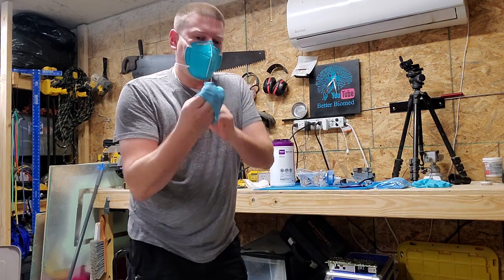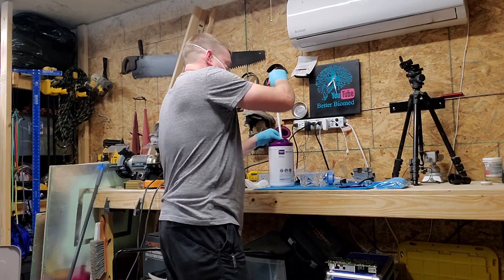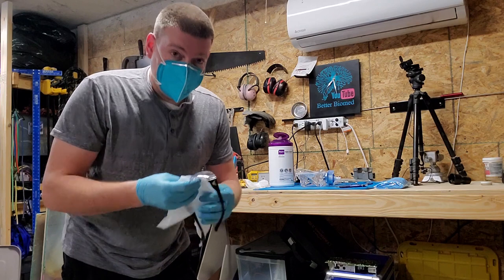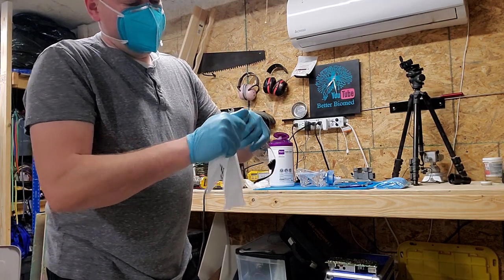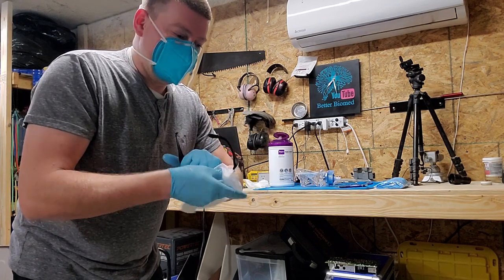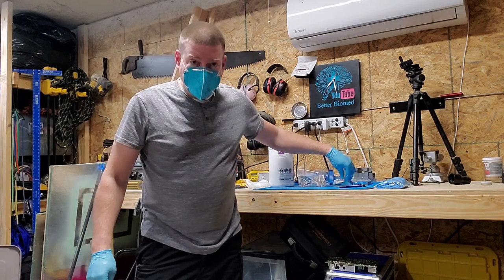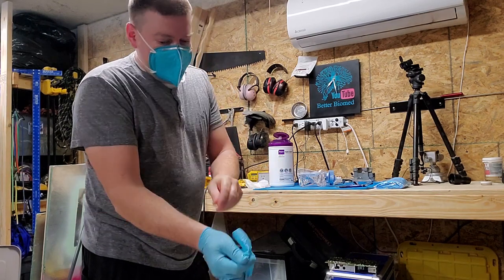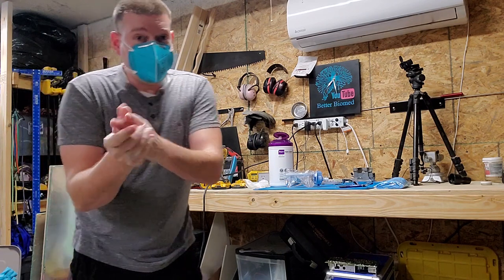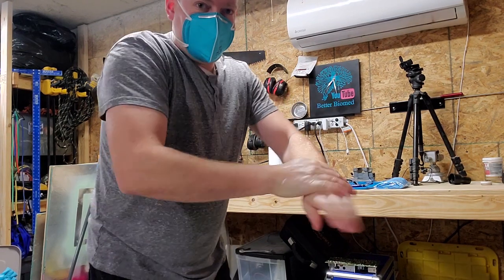Now if I'm using my goggles, I'm going to put on some gloves, and I'm going to wipe down my goggles. Even though there might not be anything on them, you've got to wipe them down. Mind you, I haven't taken off my mask yet. Normally this is right near the door to go into the COVID patient's room, or right outside the door. There's a place where you can get a mask and turn your mask in. It's where there's also wipes. So that's where I'm going to wipe down my goggles, throw the wipe away, and throw my gloves away. Sanitize again. I know, seems repetitious, right? This is how repetitive it is when you're dealing with COVID. The thing is, you get kind of good at it if you do it enough.